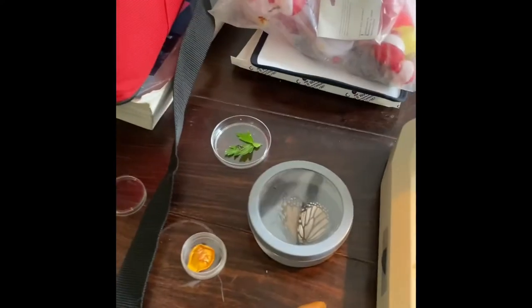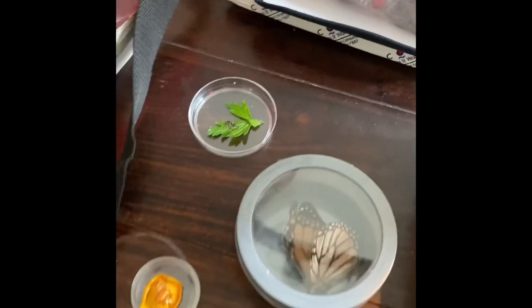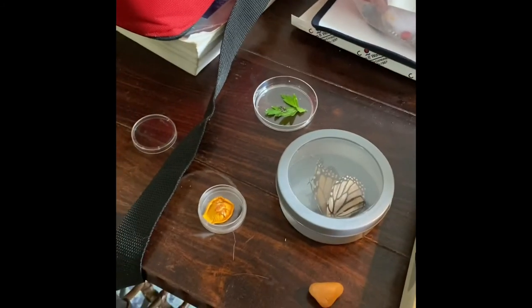It's so hard to stay zoomed in through the lens though. We should keep that specimen — that's really cool, a little caterpillar skin. Hopefully the leaf kind of stays intact as it dries out.